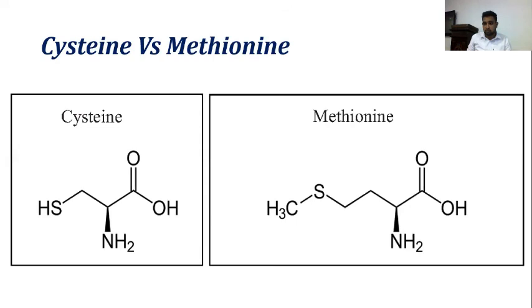If you need to confirm whether that is lead sulfide, we can just add HCl. Then it will turn into PbCl4 2- and dissolve. So do you have any questions? You need to face a practical examination. And as I told you, this practical examination will be tricky.